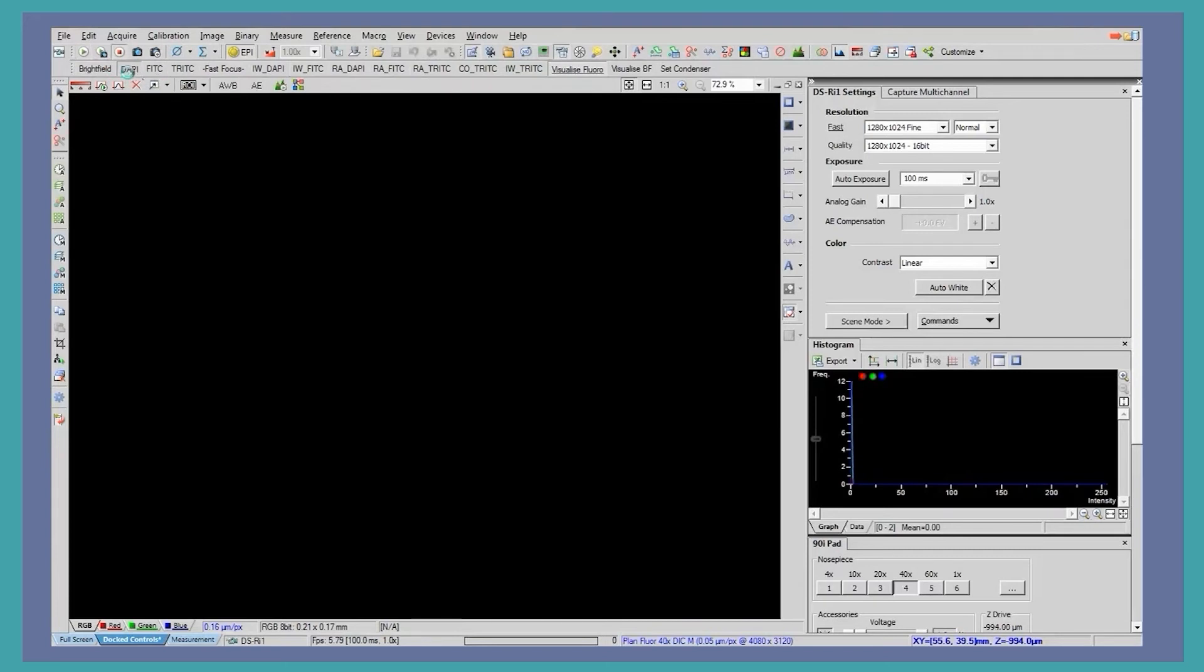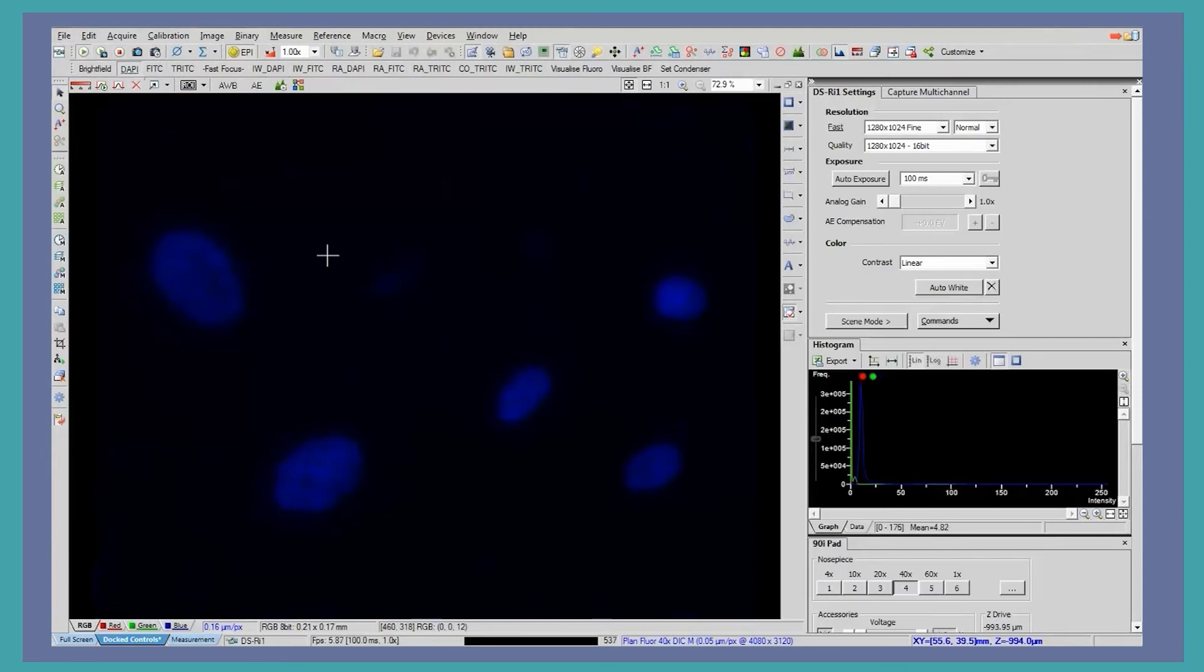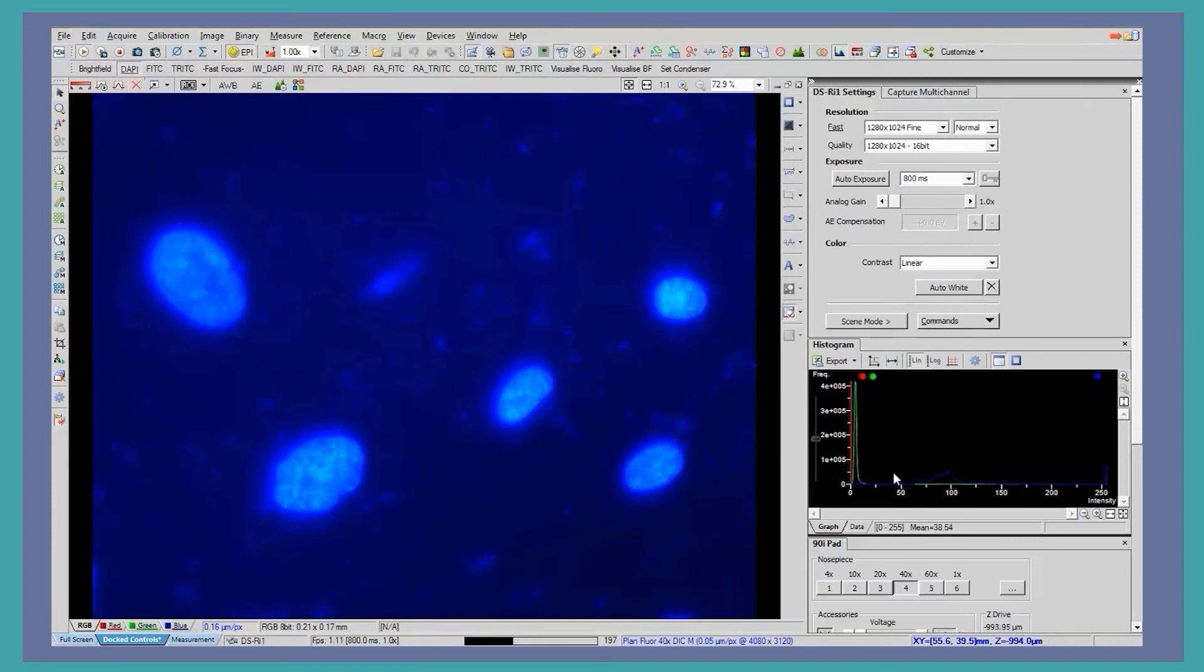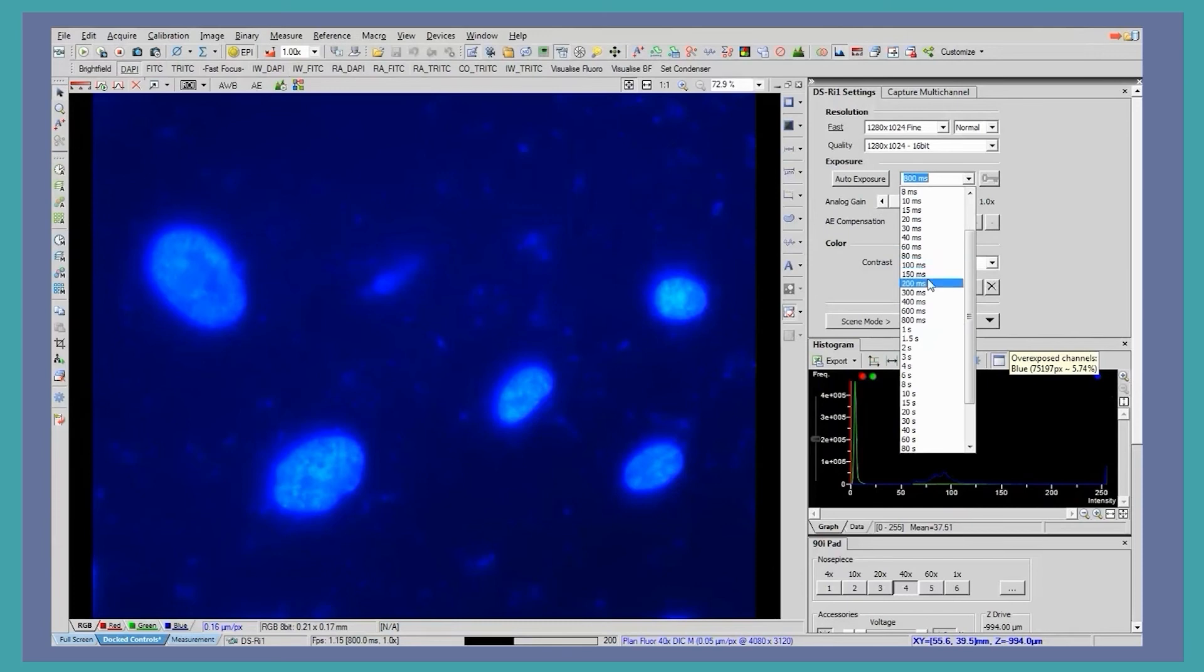These are the DAPI or nuclei of a cell. To make your sample brighter, you can adjust the exposure time. The exposure time dictates how long you let photons of light through your microscope. As you can see, this increases the brightness of the sample. However, now we have an image that is overexposed and too bright. It is important to check your exposure levels, as if the image is too bright the pixels that carry the data points will not be usable for any quantification. So it is sensible to adjust the exposure to a reasonable level where you can just see the cells.